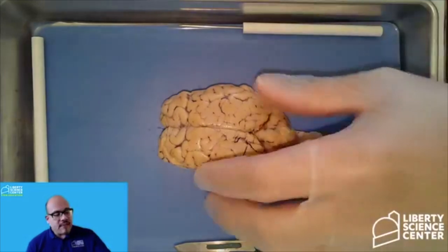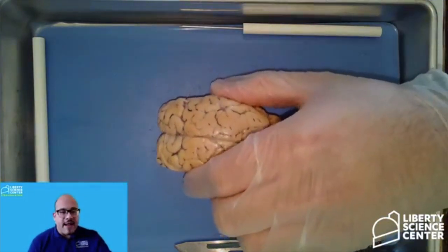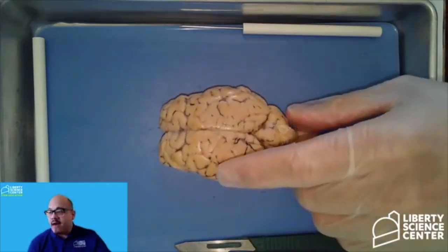So, I know a lot of you were mentioning that there are different lobes to the brain that cause different functions. I know a lot of you were mentioning that it connects to the rest of the nervous system. The brain is certainly squishy, so it is a very pliable organ. All right, so this is an adult sheep brain.